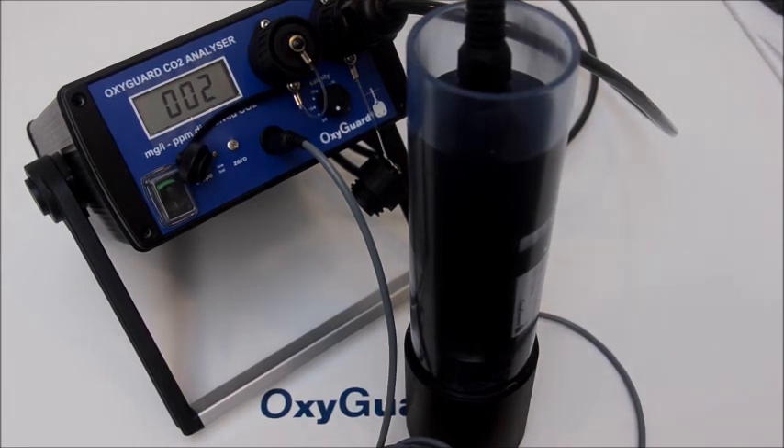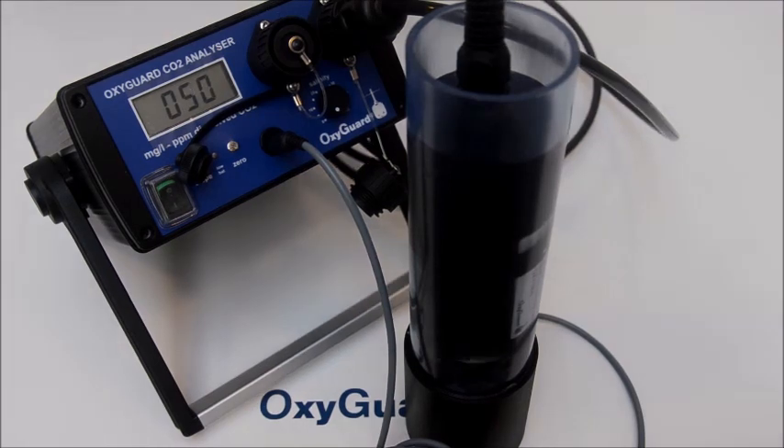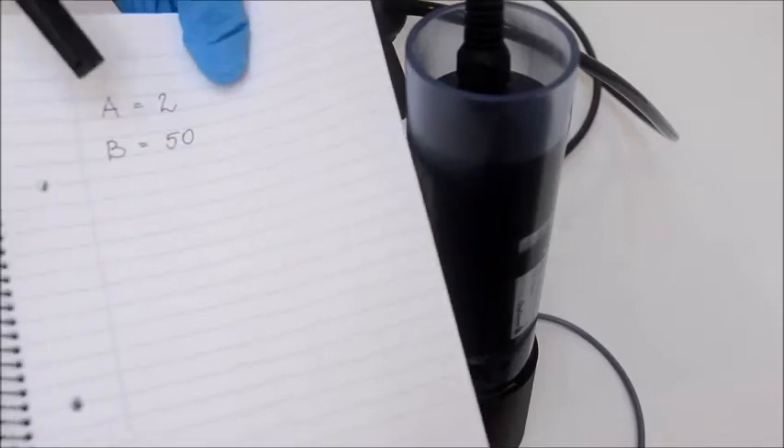Leave the probe in the beaker and keep the stirrer running, since the calibration adjustment is to be made with the probe in this water.